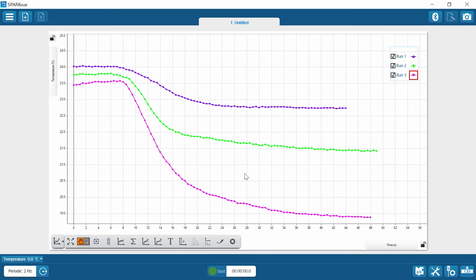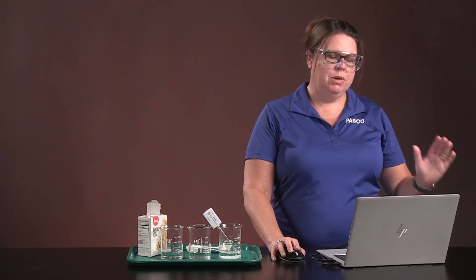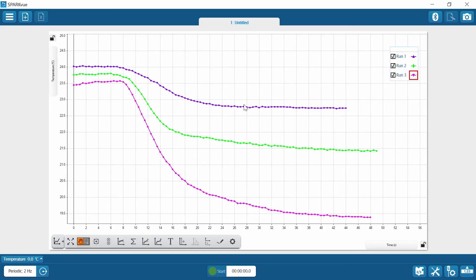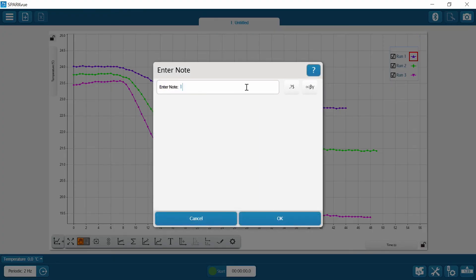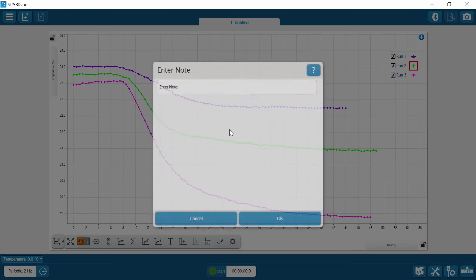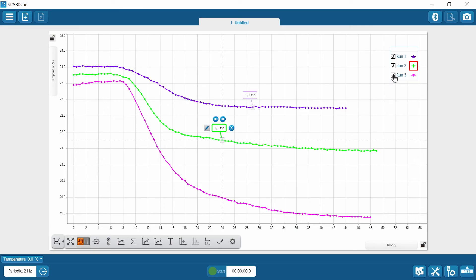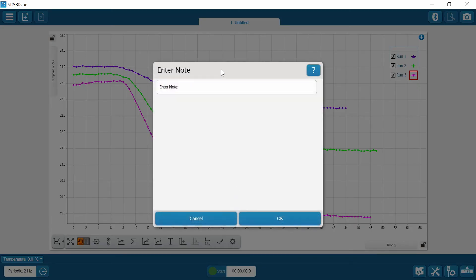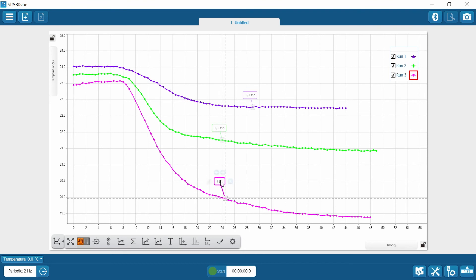It's pretty clean — you can see there's definitely a pattern. I also want to name each run so I understand how much baking soda I used. Click on the icon on run one, then click any data point in the text box, and that allows me to enter how much I used. Then do the same for run two and run three — this helps you make sure you don't mix up any of the data points. Run three was the full teaspoon.